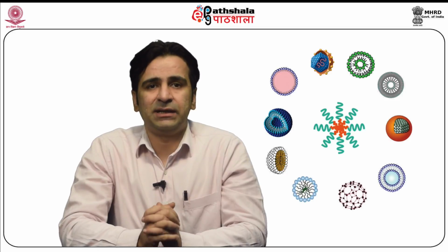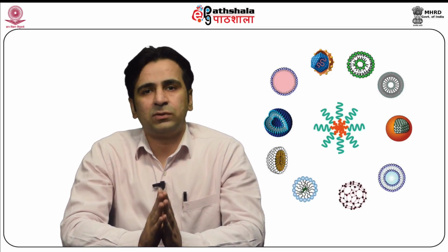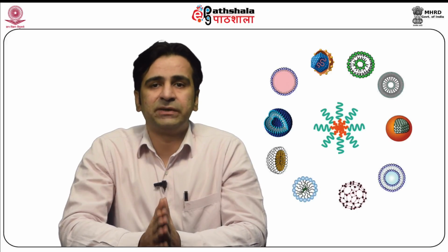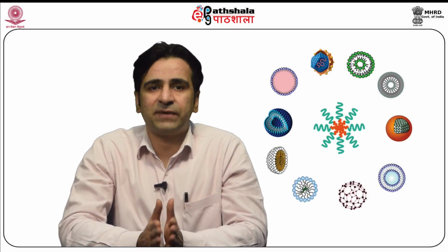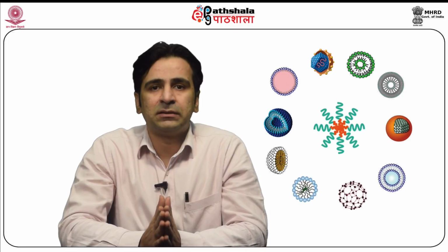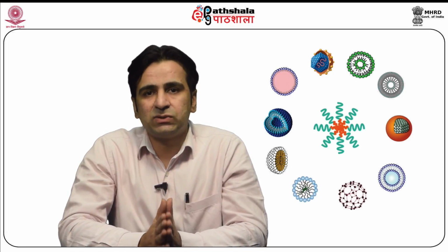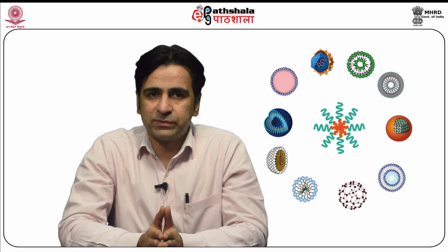So let's start with electron microscopy. Different variations of electron microscopy are transmission electron microscopy, that is also abbreviated as TEM. Next is freeze fracture TEM and the cryo electron microscopy. These techniques also reveal the morphological aspects of the liposomes.